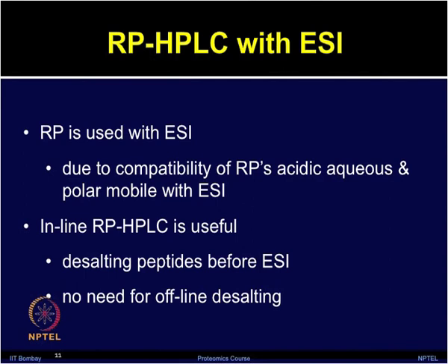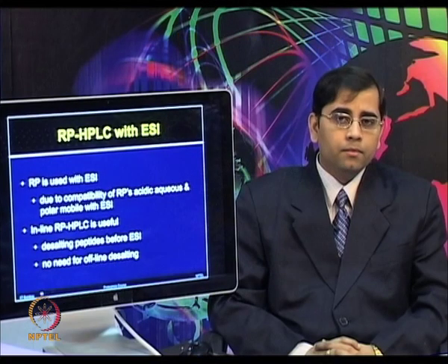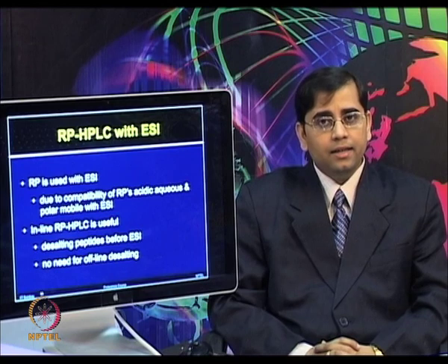The inline reverse phase HPLC is very useful because it can desalt peptides prior to ionization in ESI. There is no need for separate offline desalting and pre-fractionation. It can focus peptides from dilute samples into narrow chromatographic bands, and it also enhances the sensitivity.